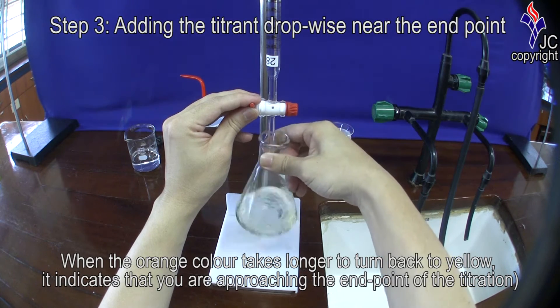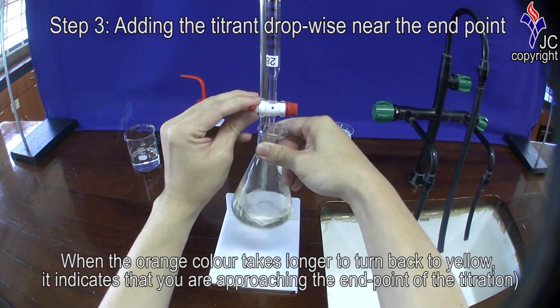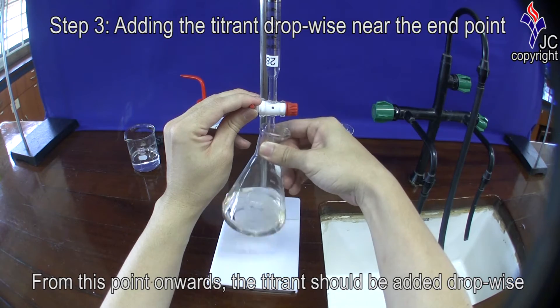When the red or orange colour takes a while longer to turn back to yellow, it indicates that you are approaching the end point of the titration. From this point onwards, the titrant should be added drop-wise.